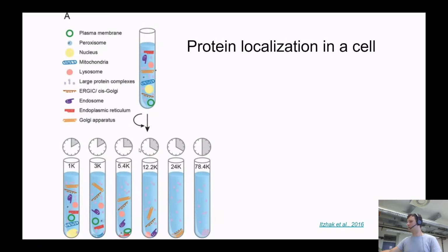Okay, now I'm going to be again very quick. One thing which I would also like to highlight is a method called protein localization in the cell. Currently, we can measure protein localization using fluorescence microscopy, but the problem with this method is that it's not scalable. Let's say you have some process and I would like to know which proteins change localization, then you have to measure the whole proteome. You have to label the whole proteome and one by one see which proteins change localization. That's a not very scalable solution.